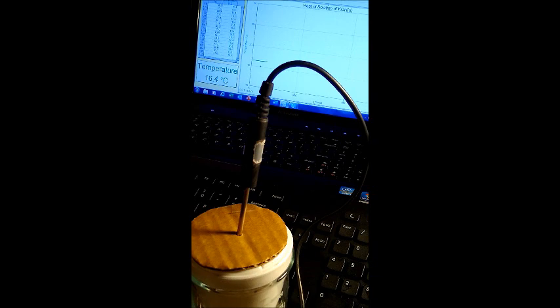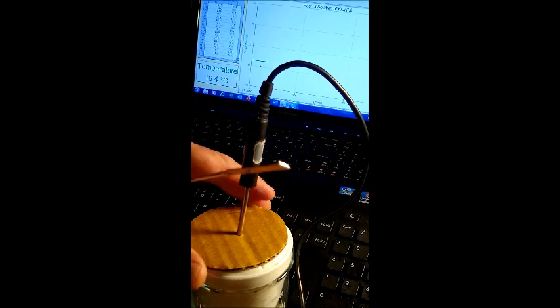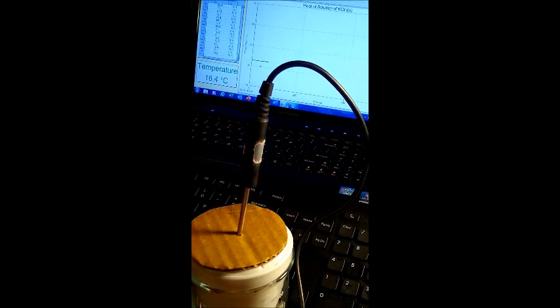Now the graph is probably going to take a little dip or something while I'm transferring the solution, but I'll see if we can do this quickly. I'll dump it all in as best I can. Okay, it's sticking a little bit to the dish, but I got most of it in there. Okay, let's get that in there. We'll put the top back on, and now we'll start mixing. Now you can see that the temperature is going up.